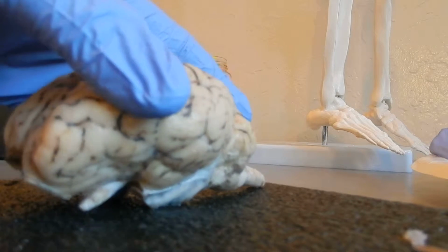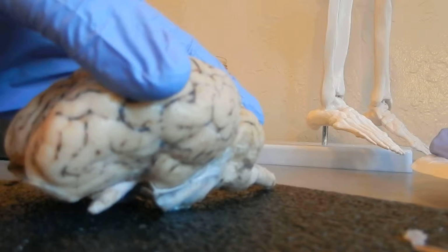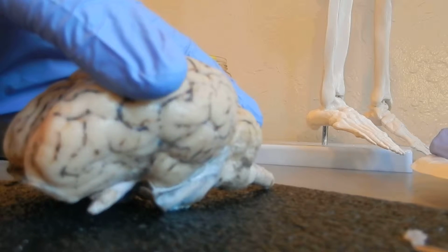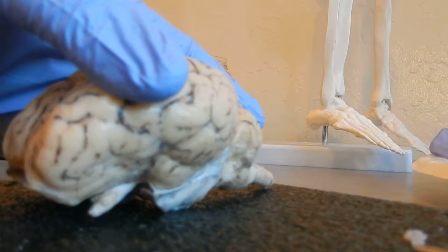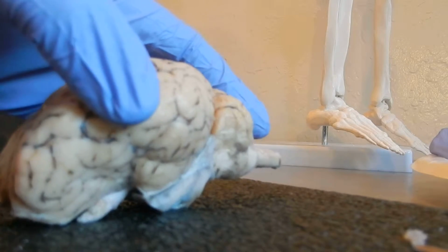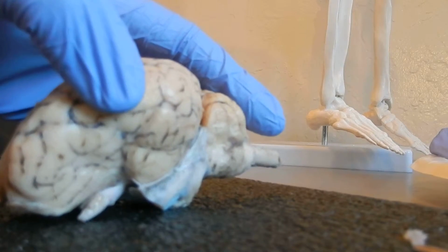Next, we're going to demonstrate a few other items on our sheep brain that we have. For our sheep brain here, just turn this over for you.